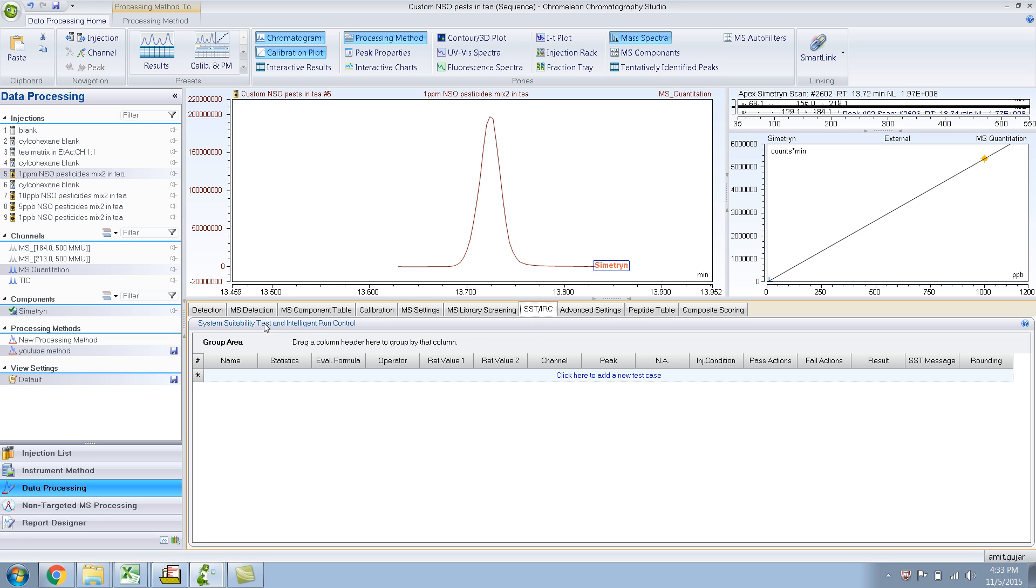SST, system suitability test and intelligent run control. It's pretty powerful. Frankly speaking, I myself haven't used it a whole lot. Maybe one of these days I can show you something good with it.